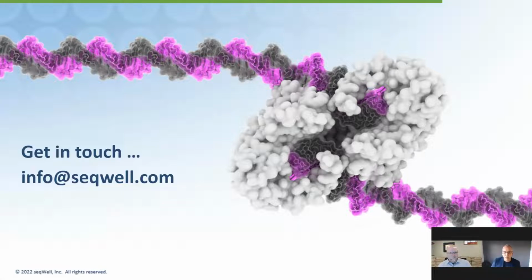That's a great question, and thank you for whoever asked it. There are certainly areas where tagmentation has historically not been the preferred approach: difficult sample types, extremely low input DNA sample types. These tend to be the domain of more ligation-based strategies instead of using a transposase.